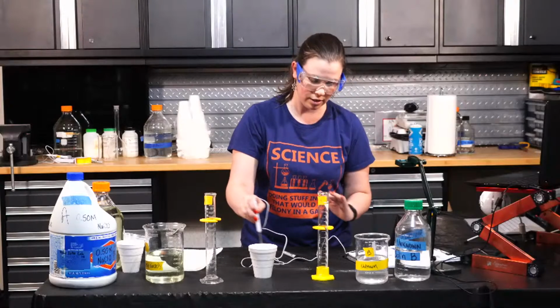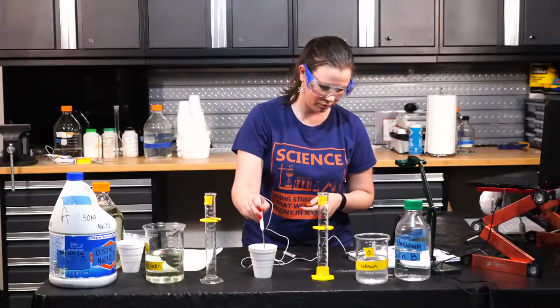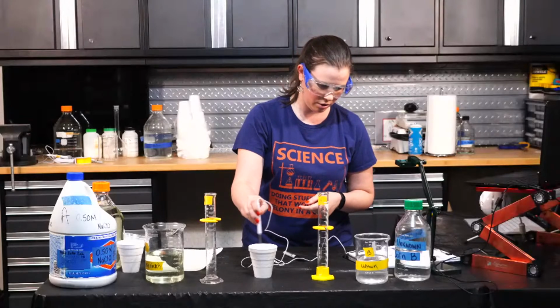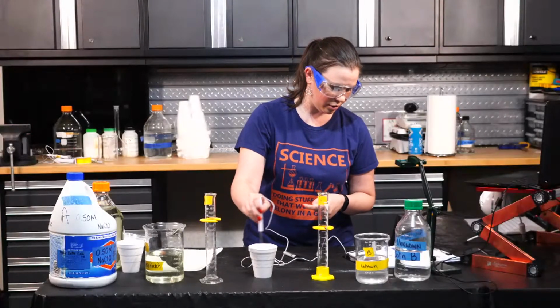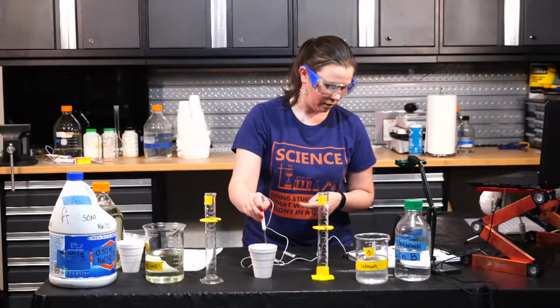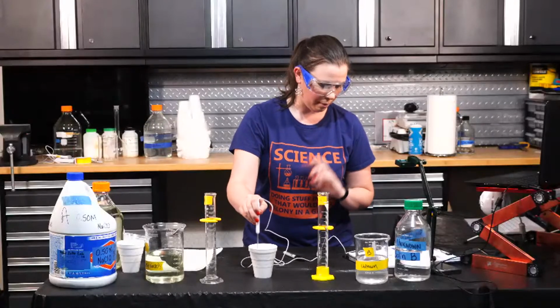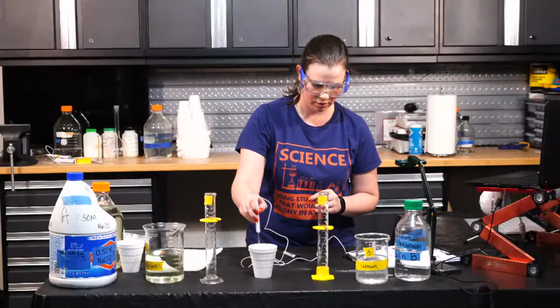Keeping my agitation consistent, right? 30.0. Still no change. So I think I'm going to call it. Maximum temperature for level 3, 30 point... Oh, wait, I lied. It went up a degree. 30.1. Now it's kind of flickering between 30.0 and 30.1, but our maximum temperature is 30.1 degrees Celsius.